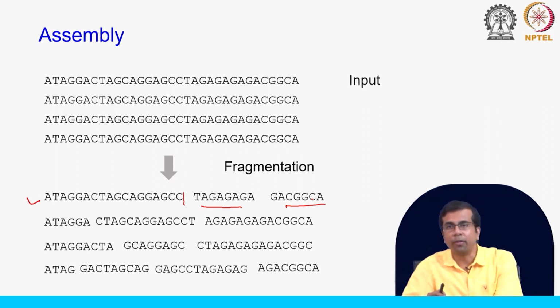So, what we will do is take these fragments and process them through the adapter ligation step, amplification, and maybe some sort of size selection where we might remove very short or very long fragments, depending again on the platform that we are using.